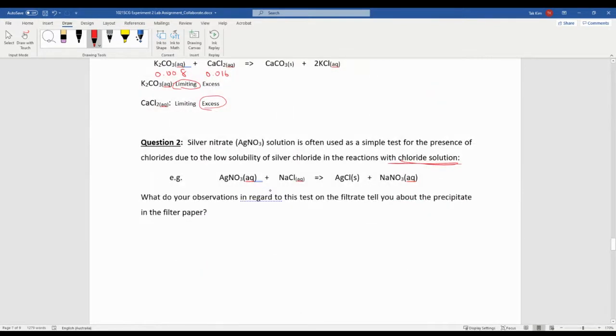So you made silver chloride by adding this one to your filtrate. In your filtrate, this is not the one you had; this is an example, but let me just write it again. AgNO3 plus your filtrate, making AgCl, which is solid. These are all aqueous, by the way.